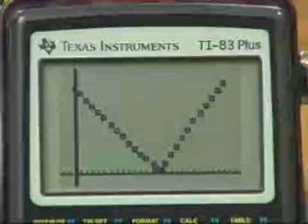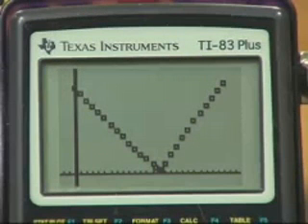The conductivity of the solution decreases until you reach the point where you have the same number of moles of sulfuric acid as barium hydroxide. The conductivity will then increase due to the excess sulfuric acid. You will use the intersect program to find the point of minimal conductivity. At that point, the moles of barium hydroxide equals the moles of sulfuric acid. You know the concentration of the sulfuric acid. You will solve for the concentration of the barium hydroxide.